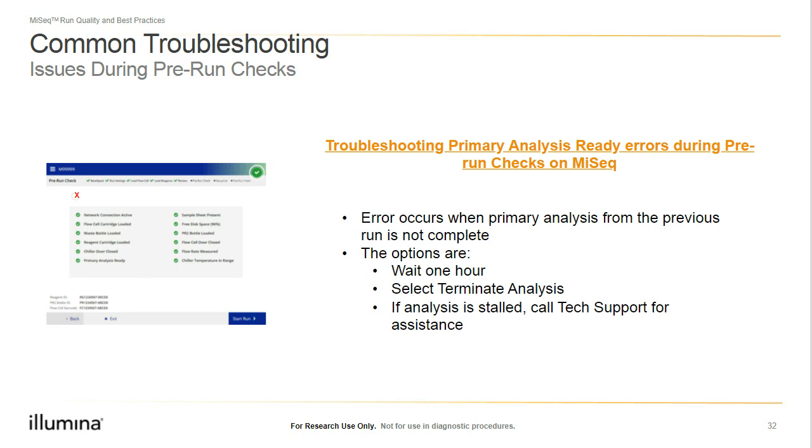Please note that this will result in no additional BCL data being generated for the run, which is still being analyzed, and is effectively canceling the run and canceling the data generation process. If the analysis is stalled and we'd like tech support assistance, or the error persists after terminating the analysis, please go ahead and give us a call here in tech support, and we'd be happy to assist further.